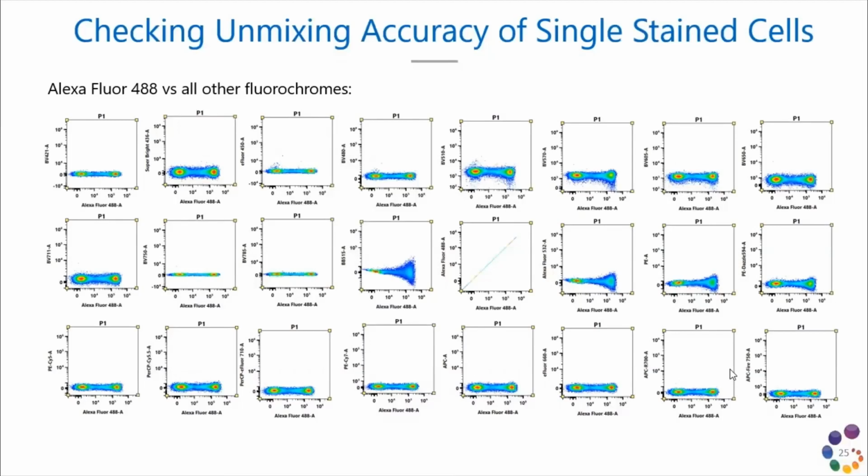We see this happening sometimes when beads are used as reference controls, and the spectrum of the dye when the antibody is bound to the bead is not identical to the spectrum of the dye when the antibody is bound to the cell. Remember, your single-stain cells are your gold standard and will guide you on the decision for which particle is the best choice for each of your controls.